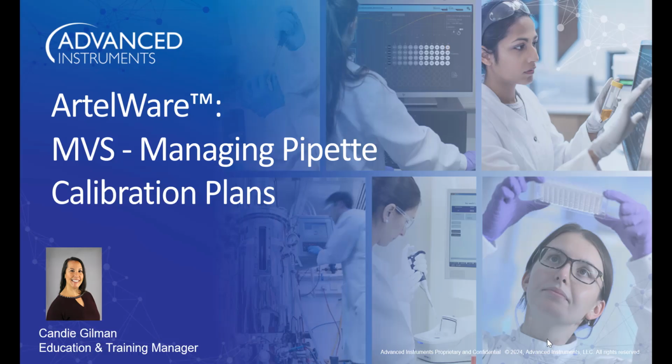Thank you for joining me for this brief tutorial focused on managing pipette calibration plans for use with the MVS in the ArtelWare software application. We've got a lot of ground to cover, so let's go ahead and get started.